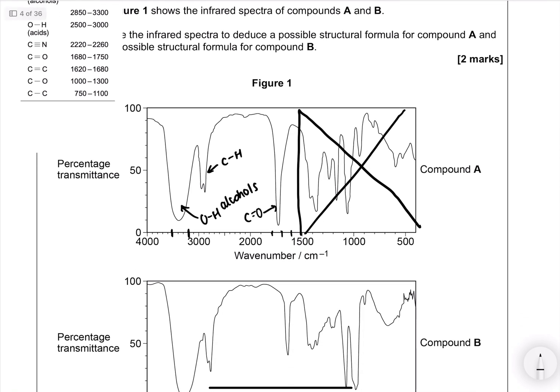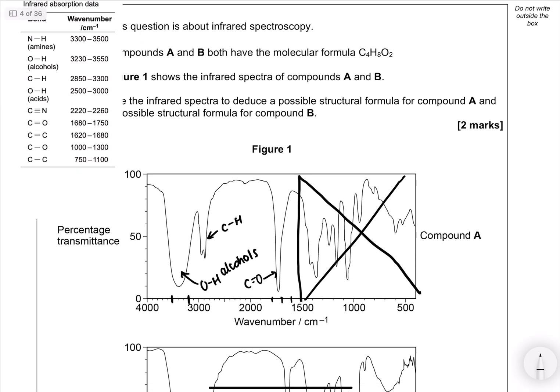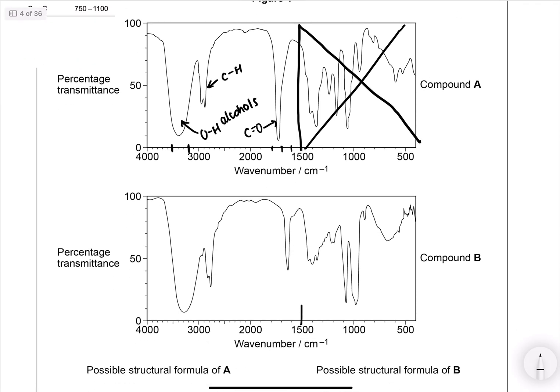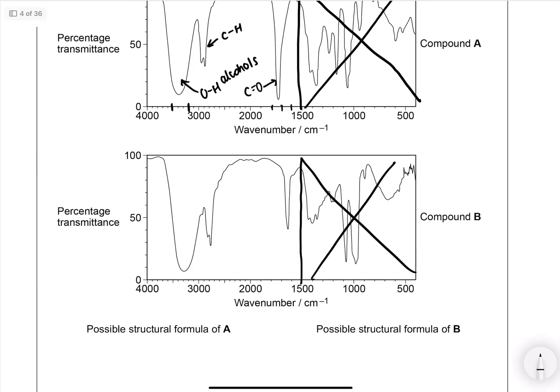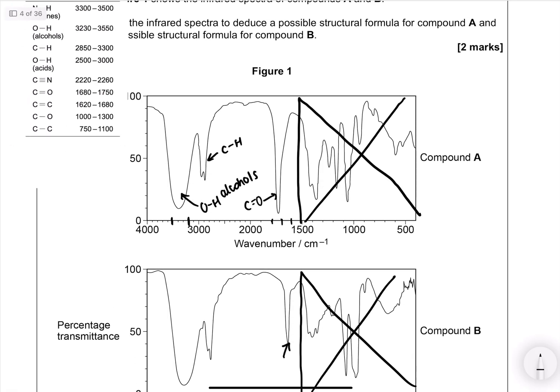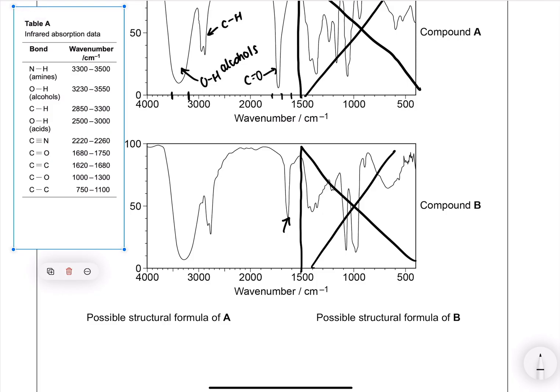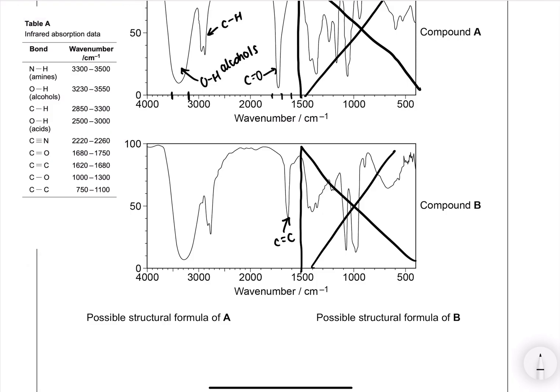And then our second spectra, again we've got that section that we can just ignore. Here between 16 and 17, let's bring that down a bit so we can see it. Between the 16 and 17, that's an alkene peak, and this is still an OH in alcohols.